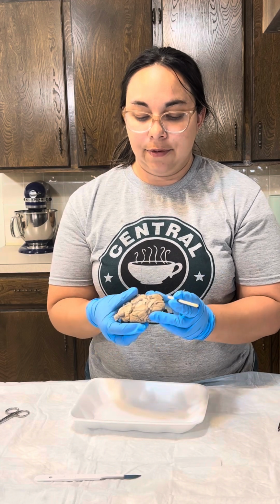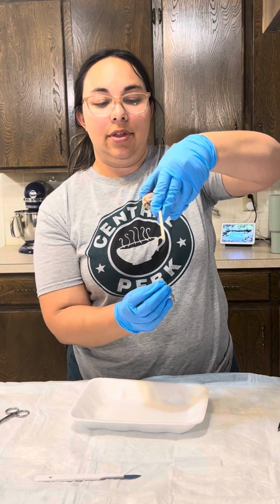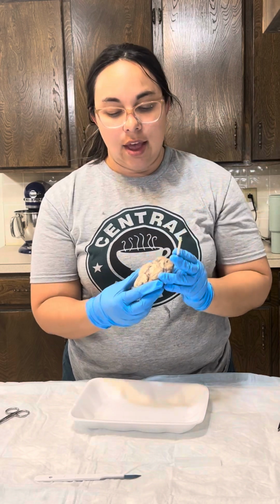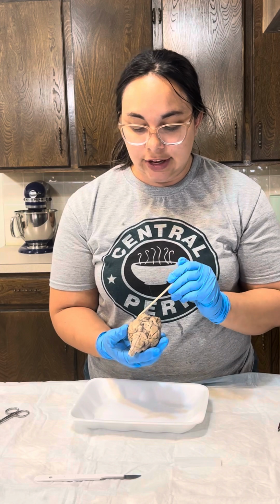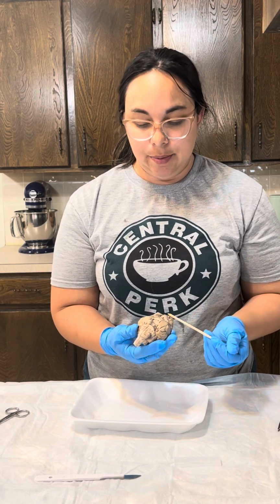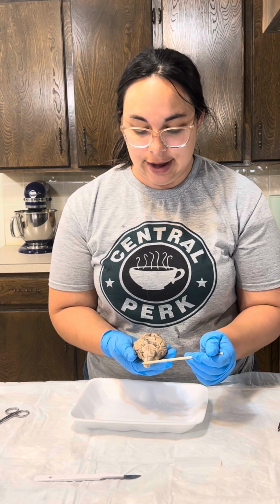And then if we flip it around, so we're looking at it as if we're coming from the neck up, we still have the cerebrum right here, and then this would be the cerebellum and the brainstem.